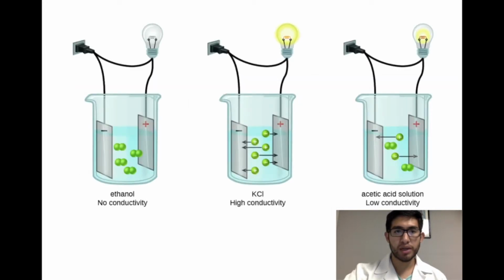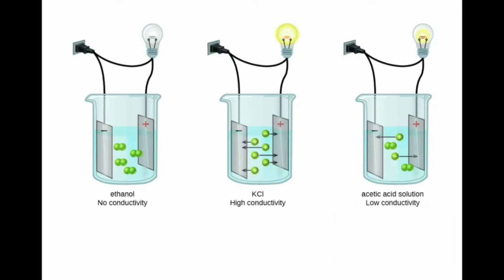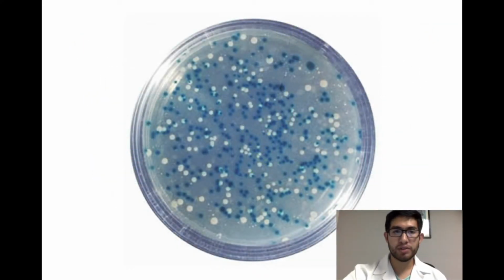To carry out a ligation, it's necessary to take into account the protocol that will be carried out and the concentration of salts. The concentration of salts for chemically competent cells should be adequate to allow the neutralization of the charge. On the other hand, in a protocol for electrocompetent cells, very high salt concentrations should be avoided because the voltage supply can generate electrocution of cells. Finally, it's important to know which cells are correctly ligated.